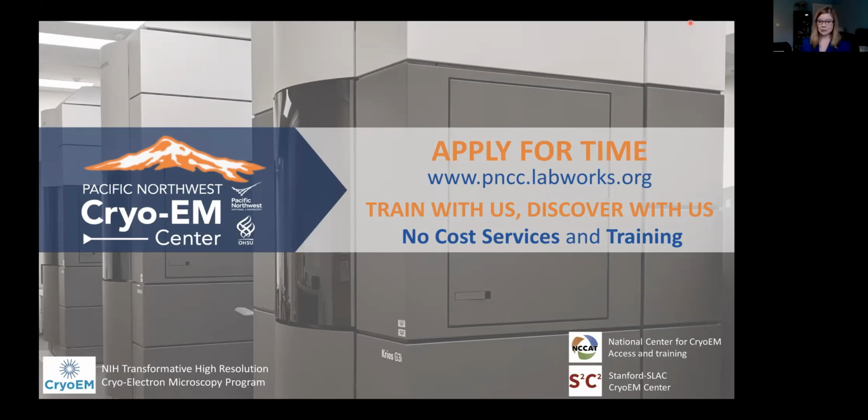And for sample preparation, we have a Vitrobot and Leica GP2 with a VitroJet coming in early 2021.